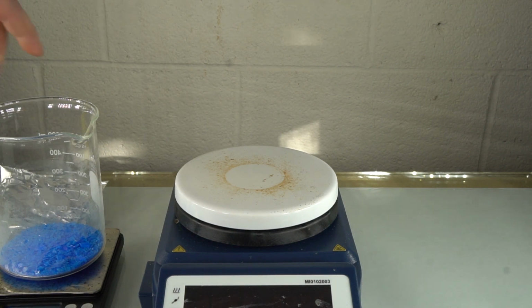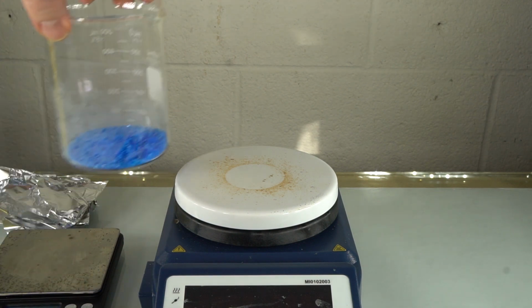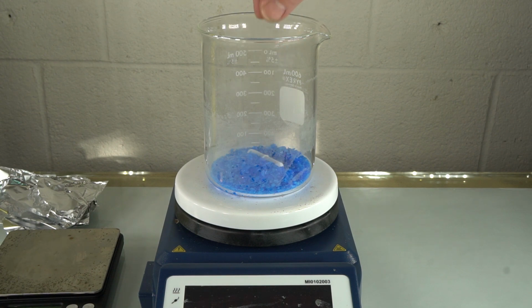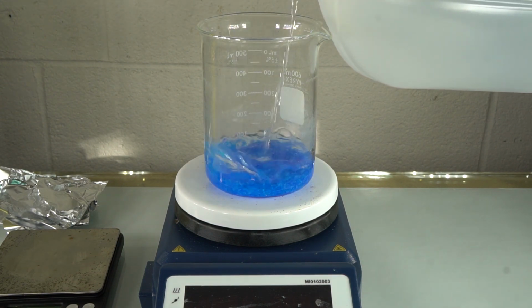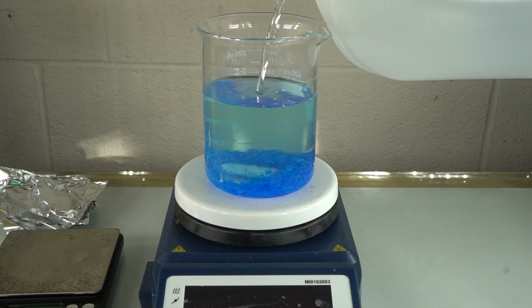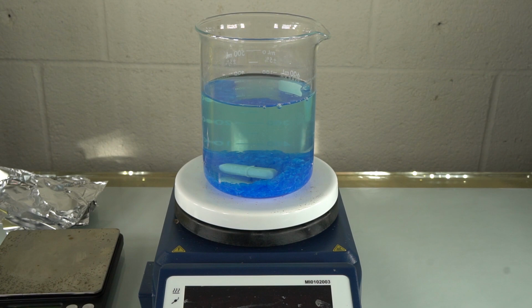And you know, copper sulfate can be quite hard to dissolve. It's notorious for taking a while to dissolve, which is why we're going to use the hot plate stirrer here. Just a magnetic stirrer, and I'm going to put in a Teflon magnetic stir bar. We don't have to heat it up. And 400 milliliters of distilled water will easily dissolve all of that. It'll just take a few minutes.